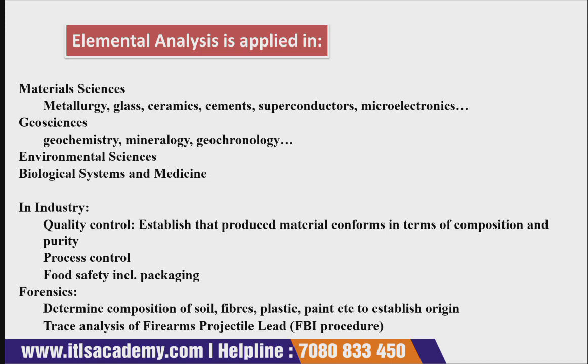Now comes the forensic. So we all know that forensic science is a field of science that involves giving justice to a particular person, okay, to a victim, right? So how is it used in forensic sciences? In forensic sciences, it determines the composition of soil. It helps in the determination of fiber, plastic, paint, etc.